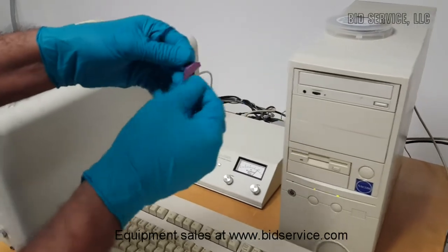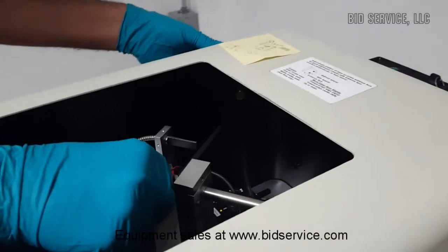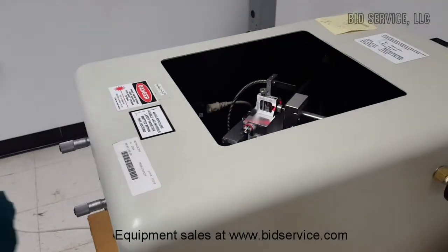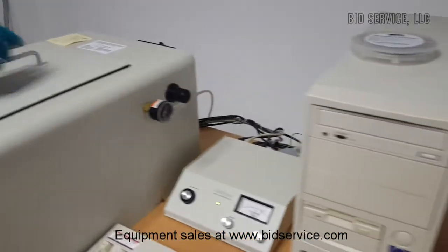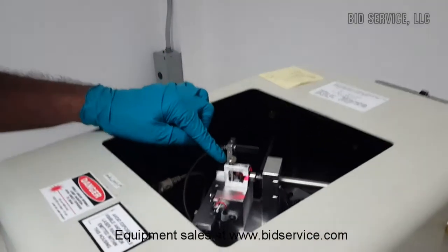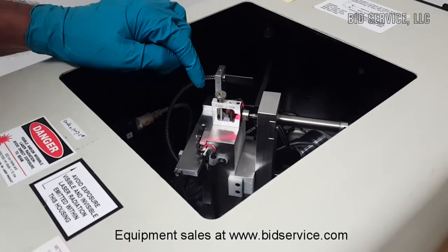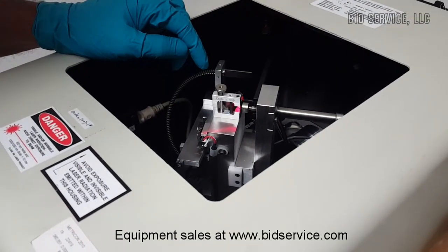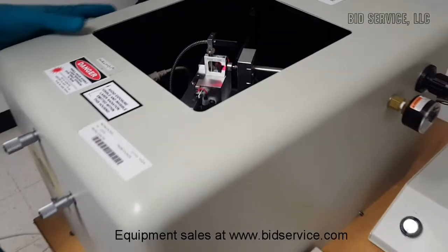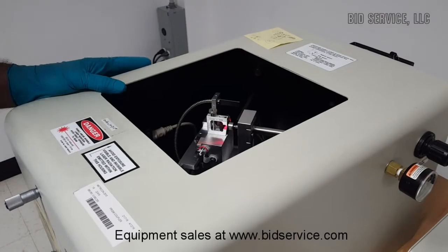I have silicon dioxide on silicon. We have to position it near the prism and then turn on the pneumatic switch. Once it is held, the prism coupling is very critical for the measurements here. The location of the beam, the alignment of the beam, the gain and offset plots, and also the coupling are dependent on how clean the prism and the substrate are. So measurements are better achieved in a clean room environment.